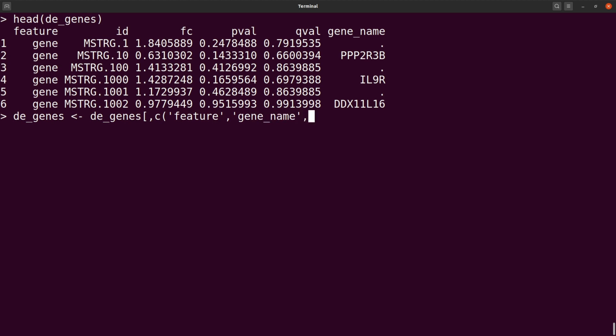So we just want to arrange this the way we want to see it. So basically that is what this command is doing for us. Perfect. So we have it here. Let's close this. So let's run this command. But check and make sure that you have the same command as I have. Perfect. So that is also done.